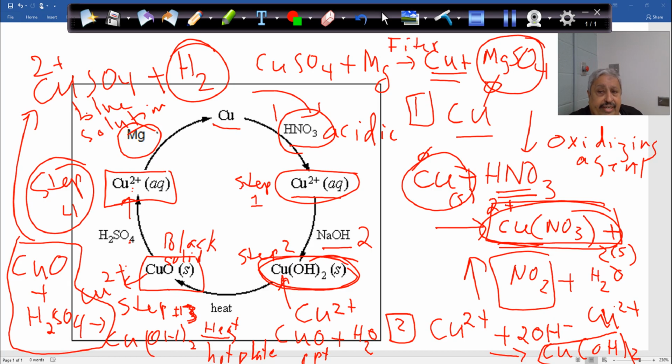So we'll do filtration. We don't have the vacuum. Vacuum's not working. So we'll do this one here with the gravity filtration. So we'll filter the solution, the blue solution out, keeping the copper by itself. Now, in this process, you have to have pre-weighed filter paper.